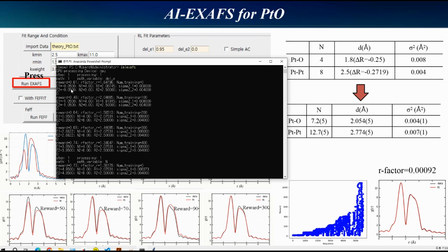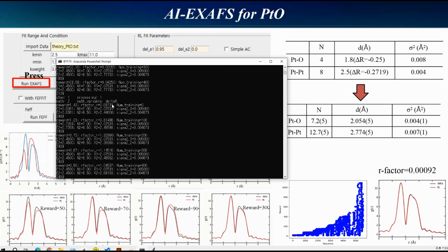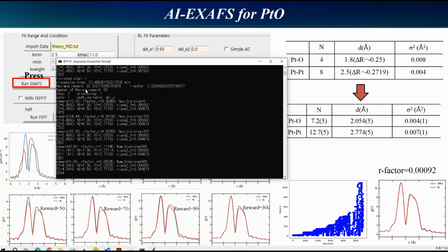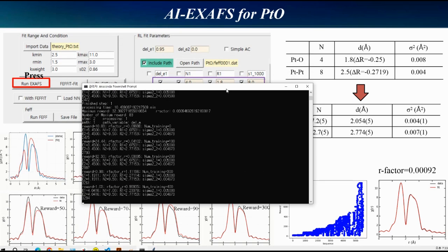Also, in one sequence the deep RL found a maximum of 32, and more findings, I think. My notebook is very slow, so the processing is also slow.